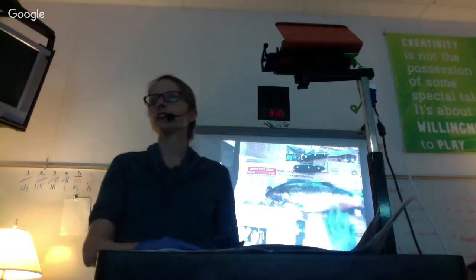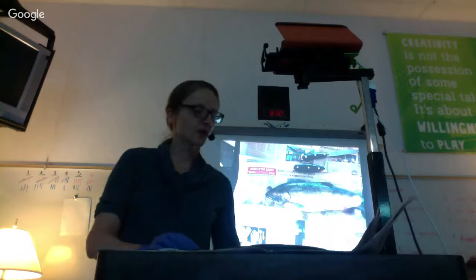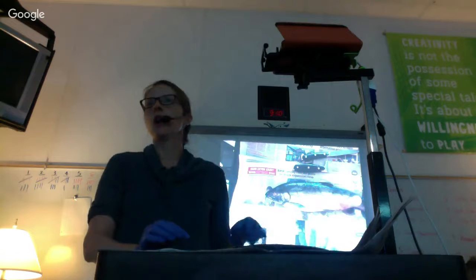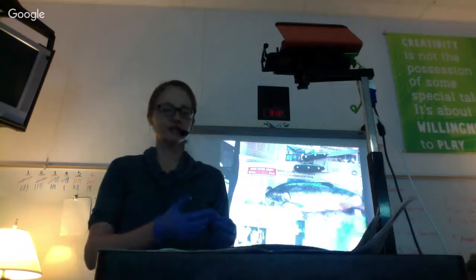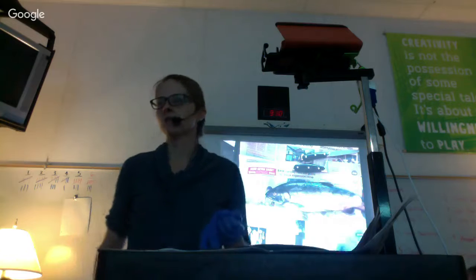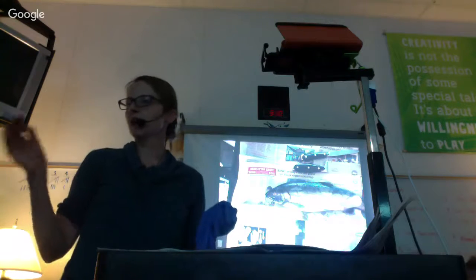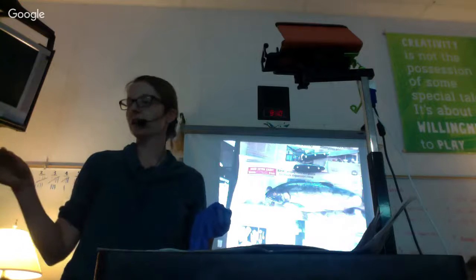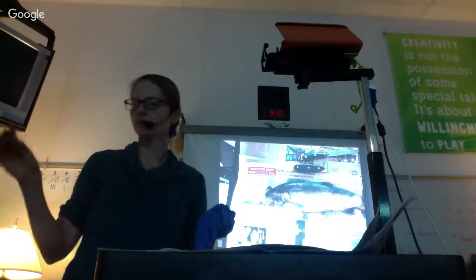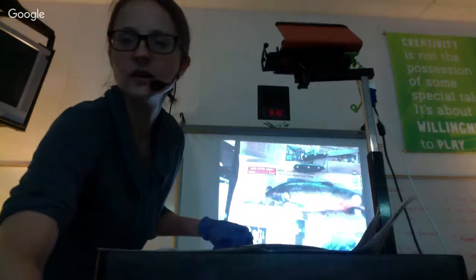So this is our salmon dissection workshop, okay? We're going to be going through step by step what we need to do for dissecting a salmon. What I'm going to do is ask you to put the salmon in the middle of the three. It should be on the desk, the middle of the three. If you haven't done that, do that now.